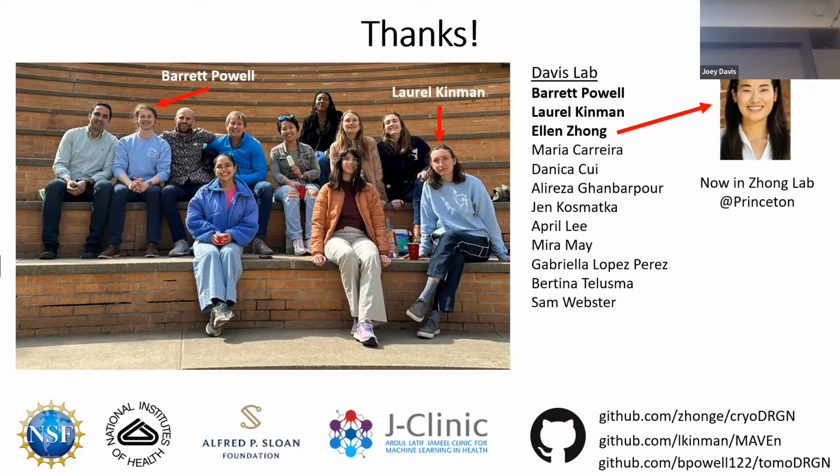Other things. Oh, yeah. So are you looking into bacteria then? So you can do some human cells. You still just need to cut the lamella into them. Okay, there's a trade-off there.